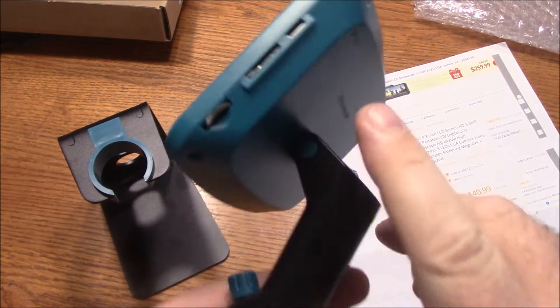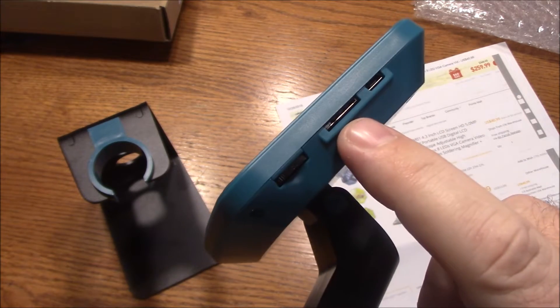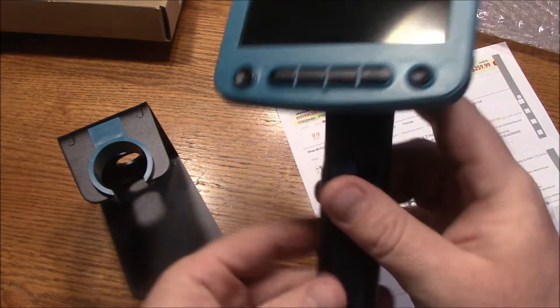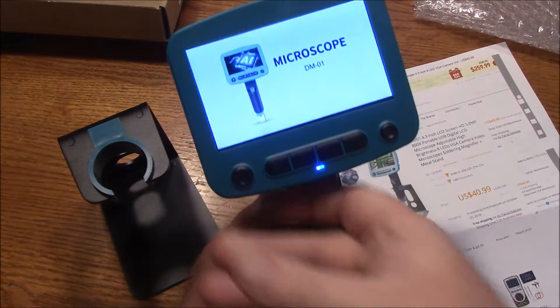So it's mostly charged. Over here on the side, it has a USB port and that's where I was charging it. It has an SD card slot, and then it has a little wheel here that rolls up and down and that controls the brightness of the LEDs. Let's go ahead and turn this on — hold down the power button. There it is.